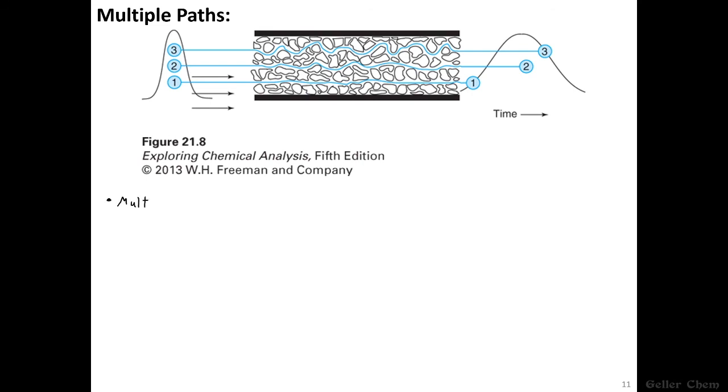Multiple paths. Our third reason that bands spread.